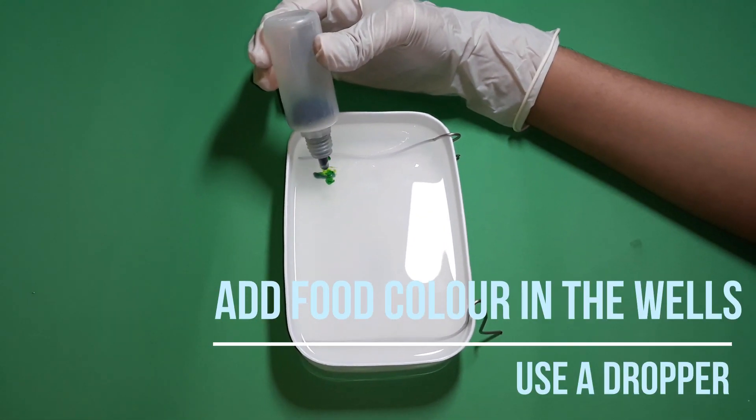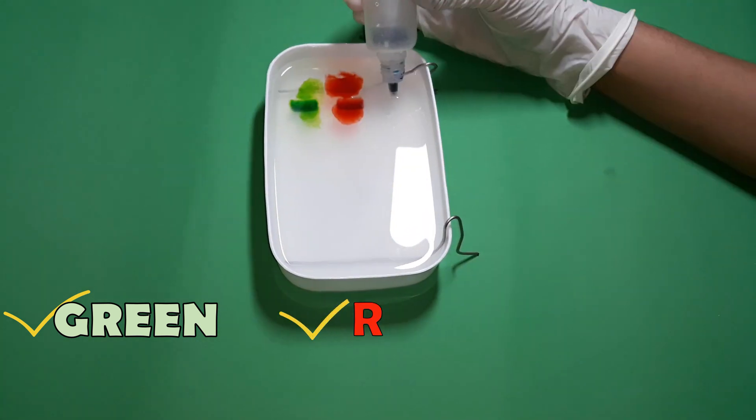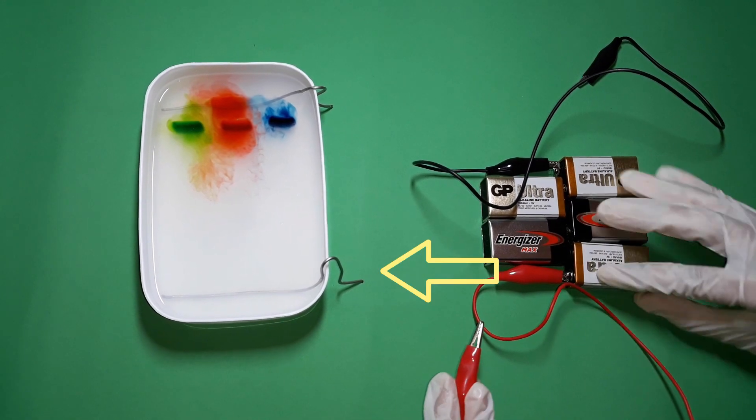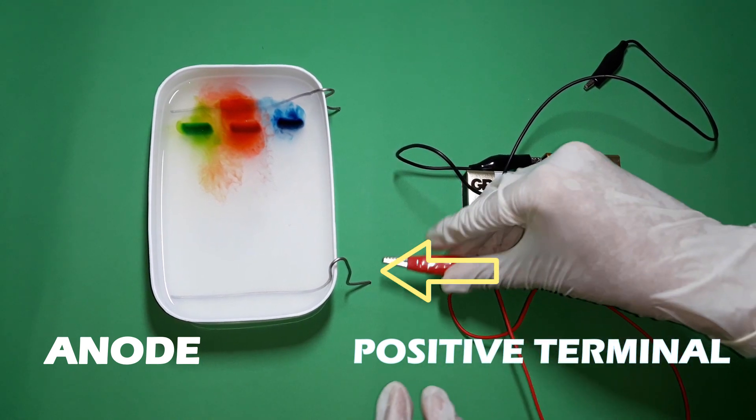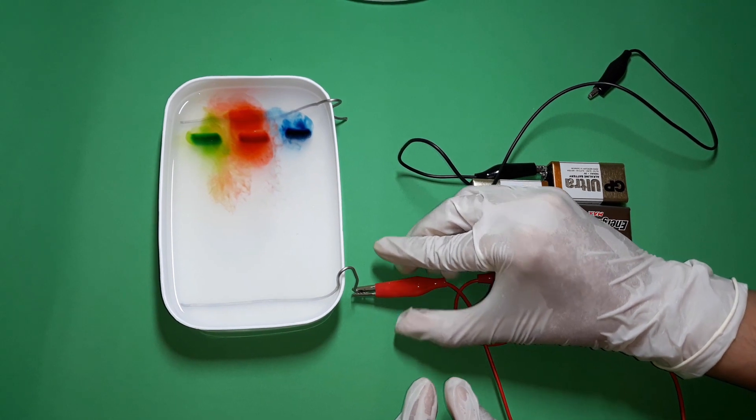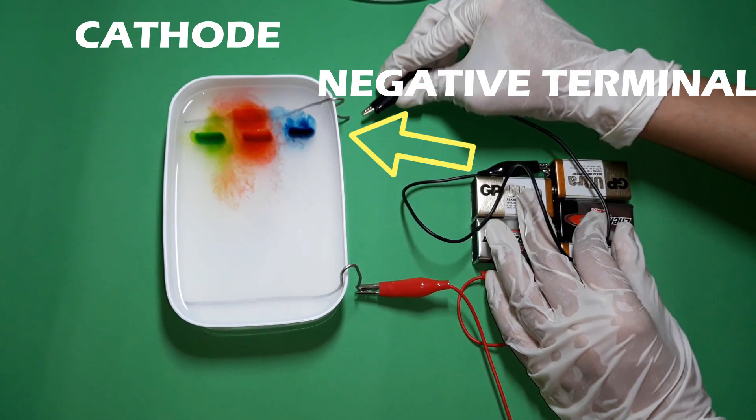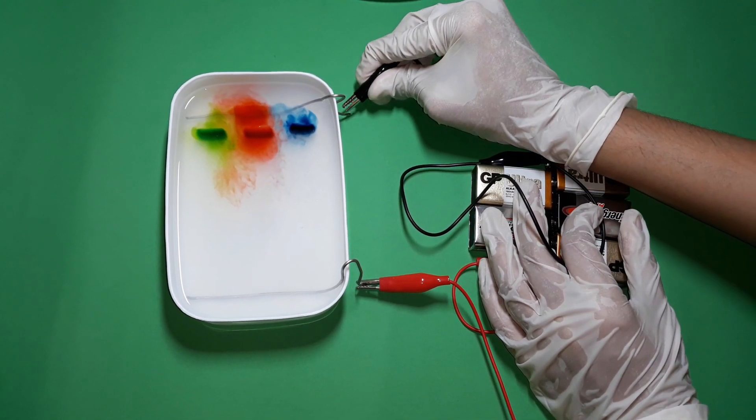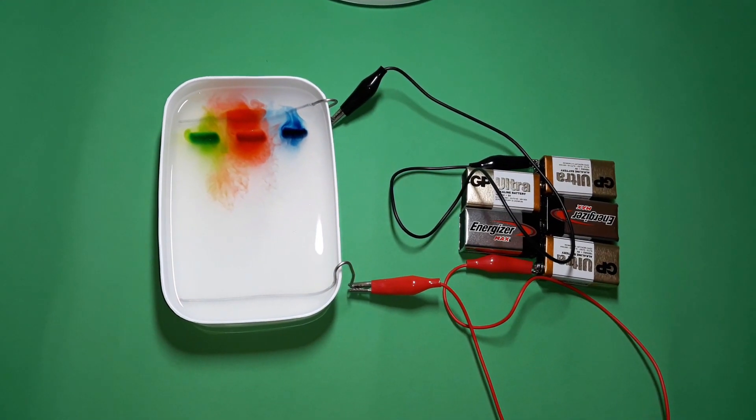Now, carefully add the 3 food colors into the wells using a dropper. For completing the circuit, the red wire connected to the positive terminal should be connected to the anode away from the wells. Similarly, the black wire connected to the negative terminal should be connected to the cathode end nearby the wells. Be careful that you do not reverse the connection or the food color will start migrating backwards.